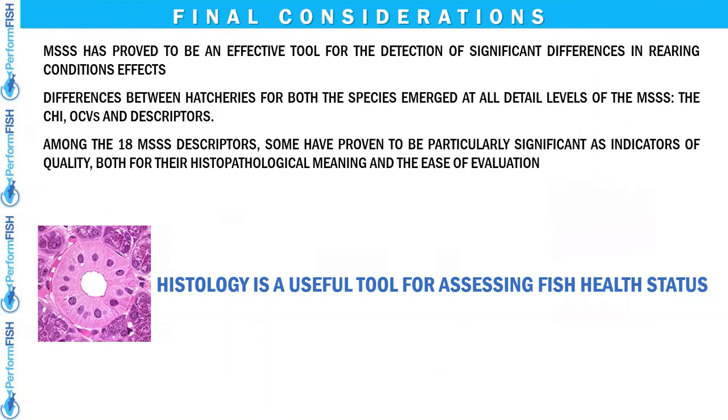But at the risk of sounding excessive, I would like to remind you of the must-have, which is the synergy with the field sample preparation operator, who must be trained, a qualified lab, and an experienced, skilled histopathologist.